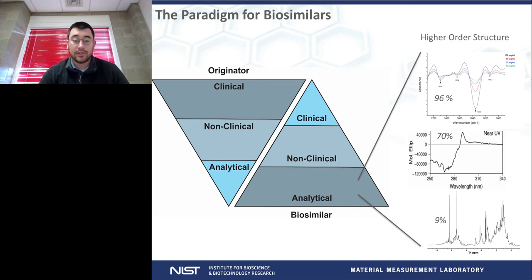However, with respect to biosimilars, we do the opposite paradigm, where we spend most of our time analyzing the actual molecular species themselves to make sure that they are in fact similar. And then we do a little bit less into the non-clinical and clinical methodologies with the understanding that as long as the structure is within a specific realm of similarity, that realistically the functionality should be the same.